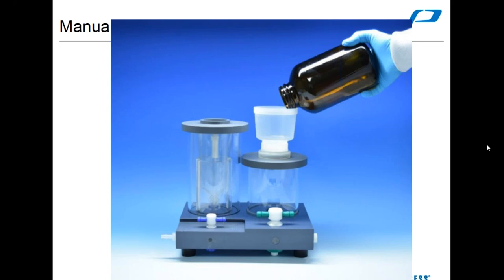What kind of vacuum pump do you recommend? We do have a vacuum pump on our website, G3050, 3060, somewhere around there. We know that works. The ultimate vacuum that it draws is not as important as the amount of air that it pulls. The only real thing you need to know is, does sample go through the disk? There are no very extreme requirements on this. I think just about any pump that's more powerful than an aquarium pump will fit the bill here. Just about any pump you've got hanging around in your lab will be acceptable.